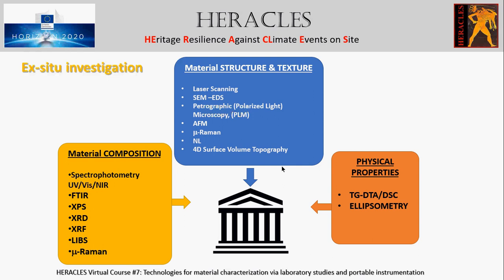X-ray fluorescence is a powerful characterization technique for the study of cultural heritage materials. It provides non-destructive elemental chemical composition of a sample already collected, needing almost no sample preparation for qualitative or semi-quantitative results.